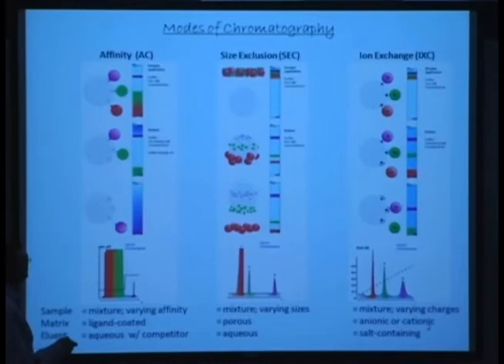interactions. And as you increase the concentration of salt in the elution buffer, as indicated here, you would see that the lower affinity molecules would come out first, followed by the intermediate, followed by the highest affinity molecules. So salt is a dominant feature here. Obviously the ones that have no charge would primarily not interact at all, and if nothing interacts, you would have a fairly big peak.